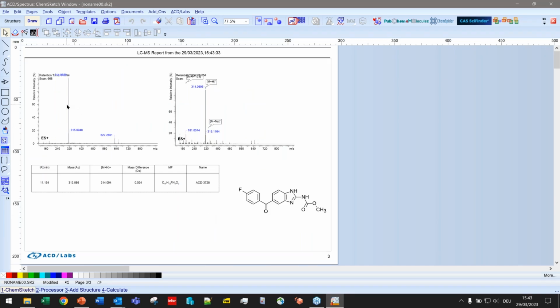All right, so this is looking quite good so far. I have the retention time here, even though it's hidden under the mass label. I have the scan number, and in my combined spectrum, I still see some things that I don't want. That's the annotations, and I can see scan, but it can't see which scans have been combined. So I have the wrong parameter here. Let me go back one more time and change that.